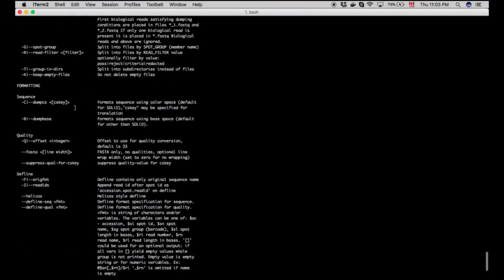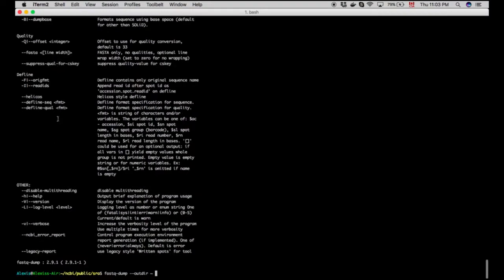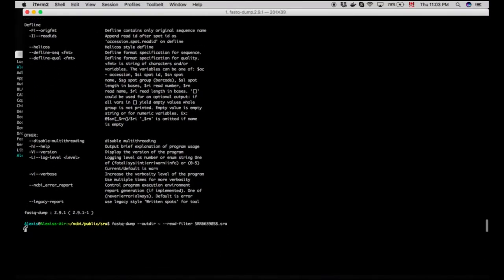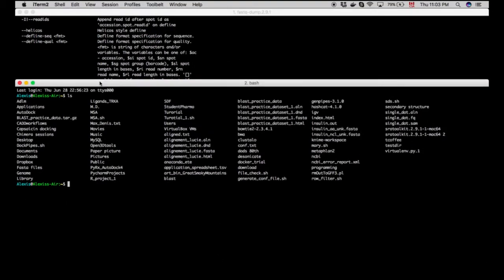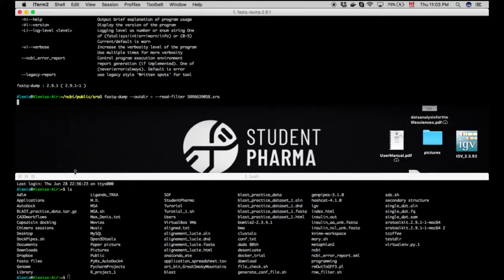And then we've got to have our read filter. And once that's done, we're going to add our SRR sequence. So just type SRR, press tab, and you can run it. It's going to take a while. You see you don't have another line that's going to pop up. And while this is running, we'll hop onto our Titin reading. So we're going to create some reads out of our Titin sequence.